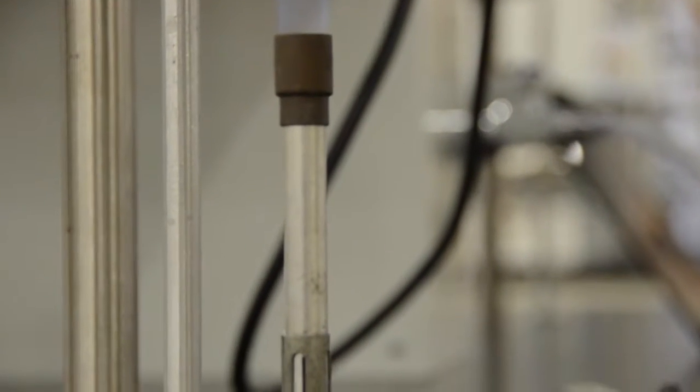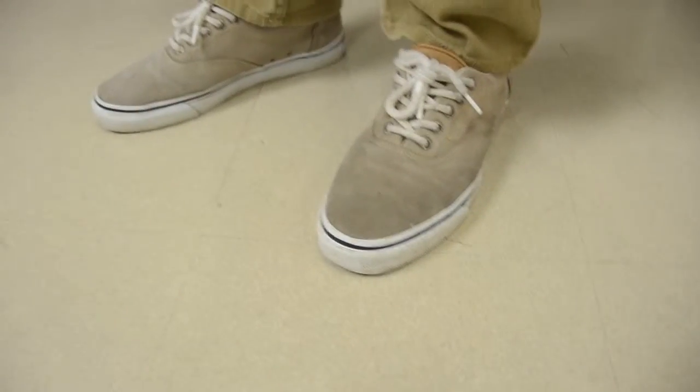Before you enter the lab, you first have to make sure that you have all of your PPE, your personal protective equipment. This includes a 100% cotton lab coat, lab glasses or goggles, long pants, and closed-toed shoes. Once you have everything on, you are ready to enter the laboratory.